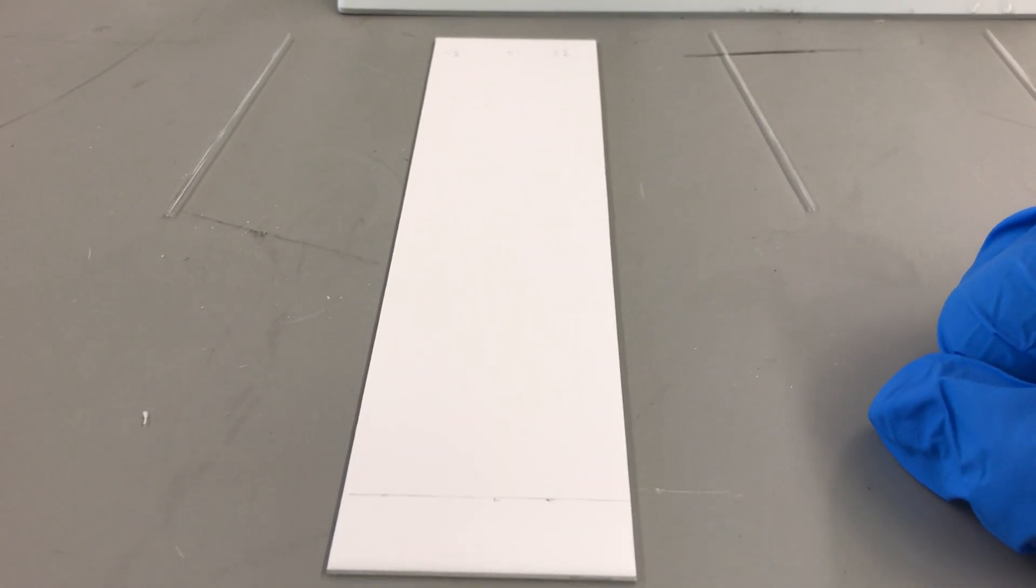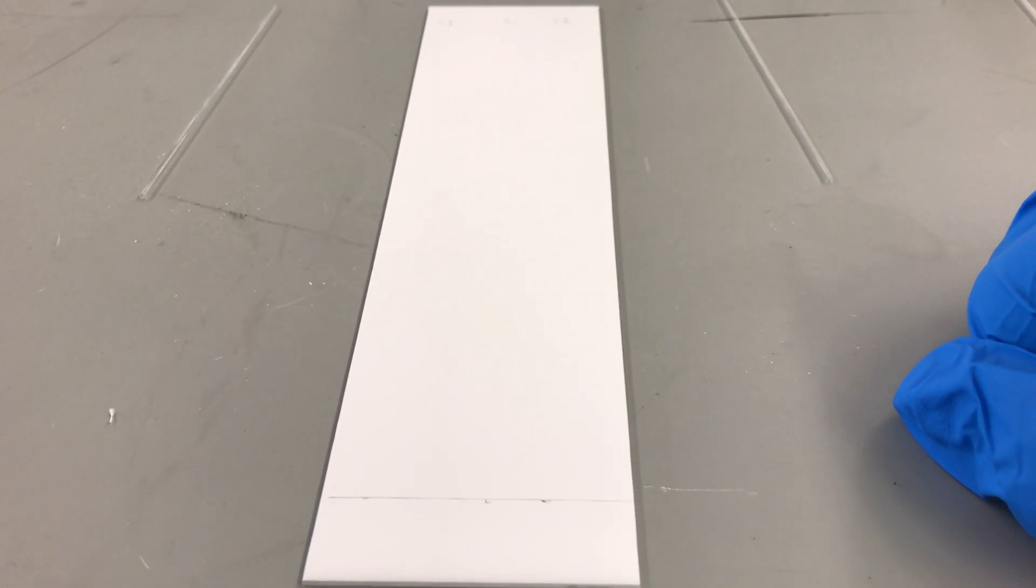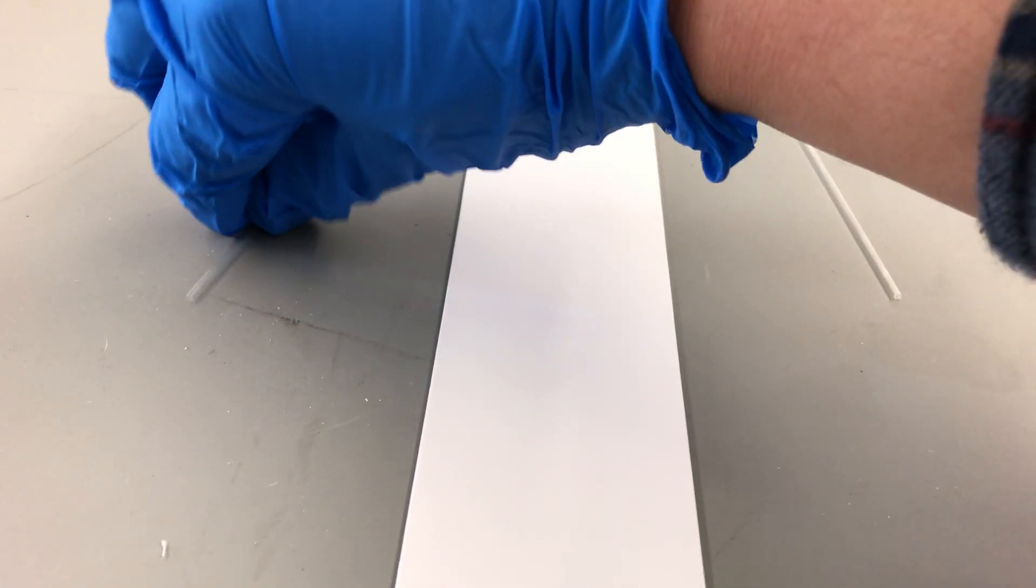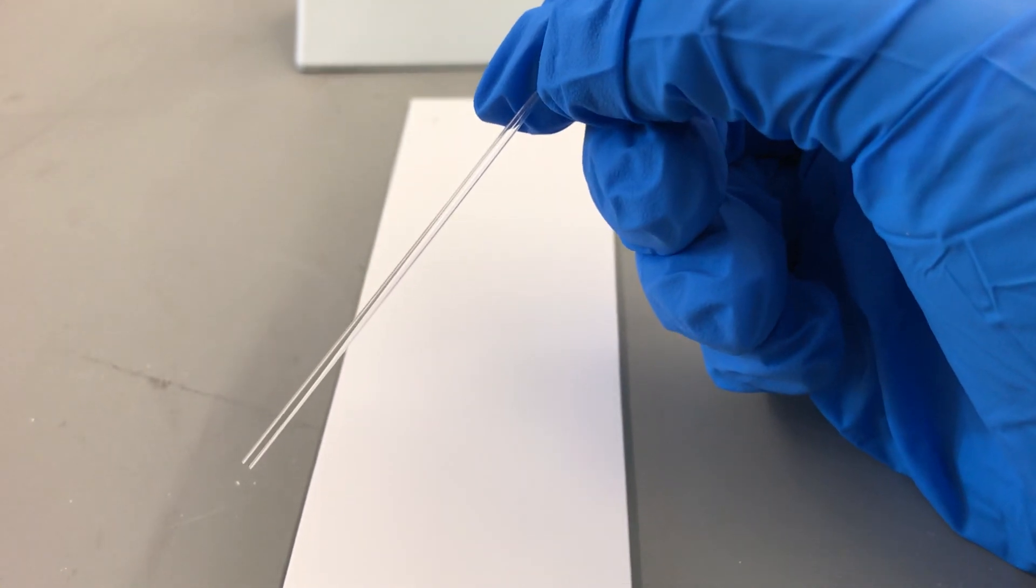Our chromatography plate is all prepared. Now we have to somehow get the lipstick solvent mixture from our test tubes onto our chromatography plate, and the way we do this is with these little glass tubes called capillary tubes.